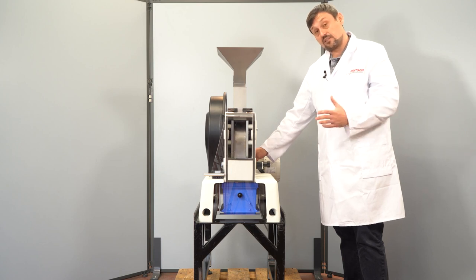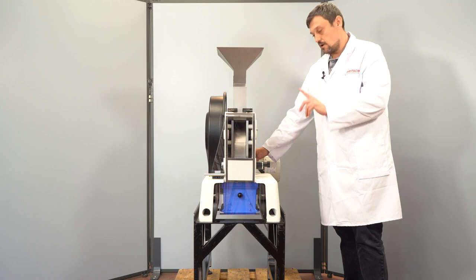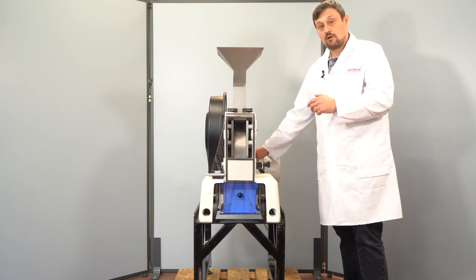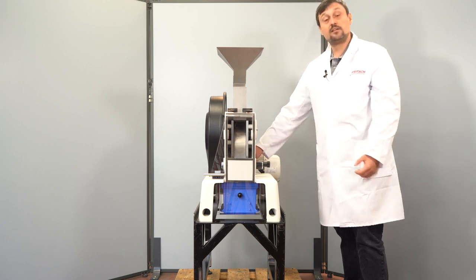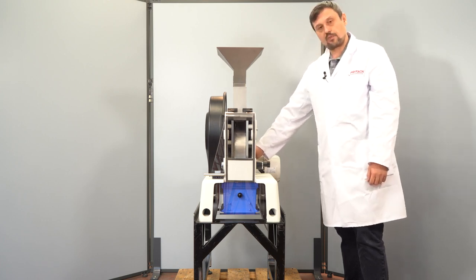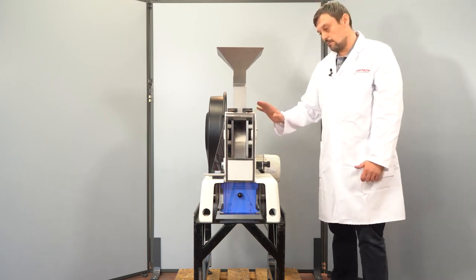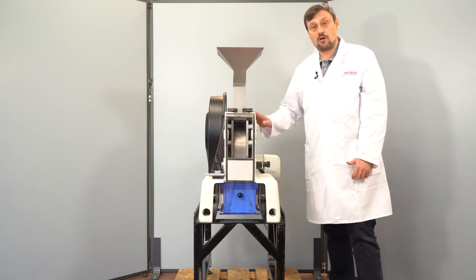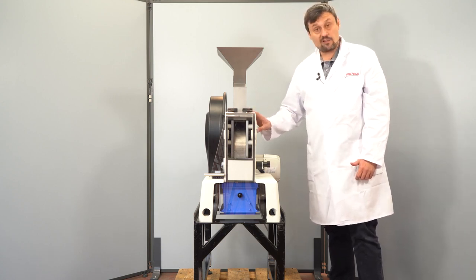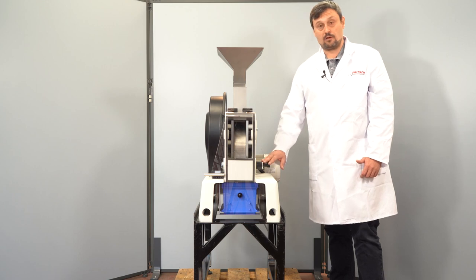Until you hear still some crushing noise or grinding sounds, let the mill run at least for 3 seconds empty and then stop the mill. Otherwise you will risk that the position between the moving jaw and the fixed jaw will clamp some particles and you will not receive 100% of the sample.